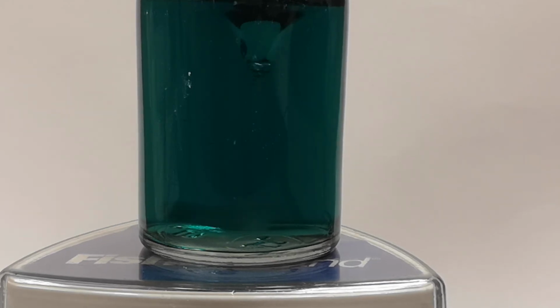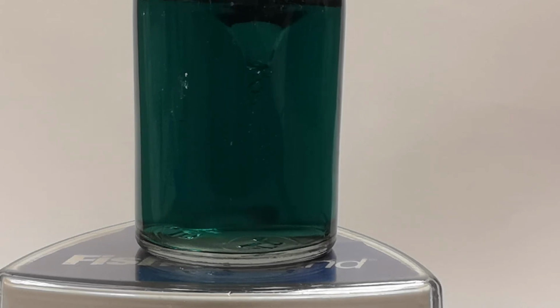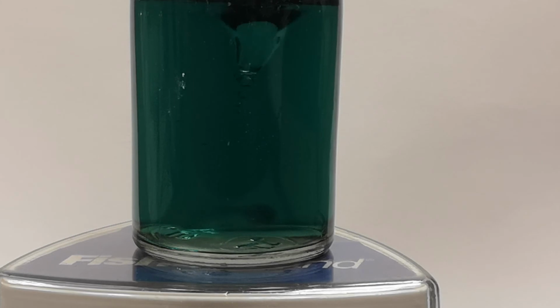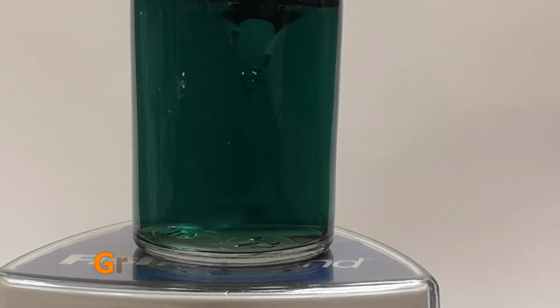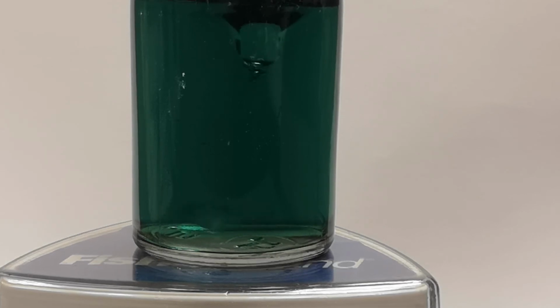But if you leave it for 24 hours or so, the manganese 4 oxide particles will settle out to the bottom. You can slow down the reaction by reducing the concentration of sodium hydroxide. This allows a clearer view of the first couple of changes, but then the final change does take hours.